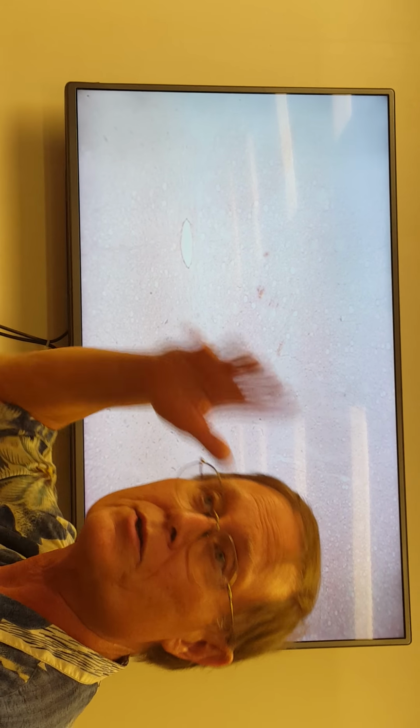Now, those motor neurons could be part of the autonomic, or they could be part of the somatic division that innervates skeletal muscle. Hard to tell. Most of the autonomic motor neurons tend to be located over here on the lateral horn. So these are probably preganglionic neurons.